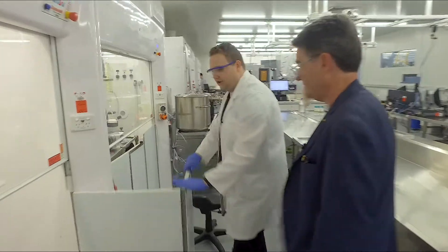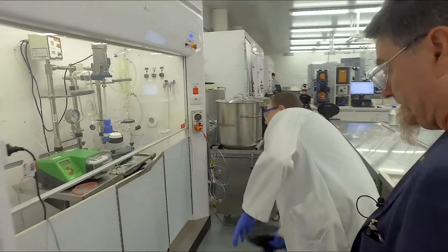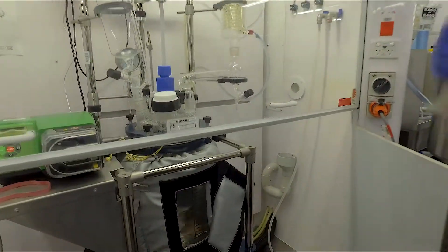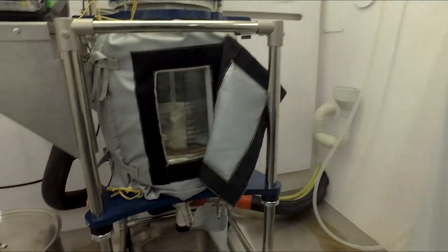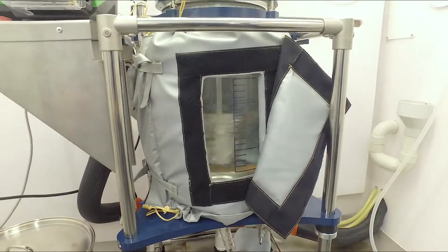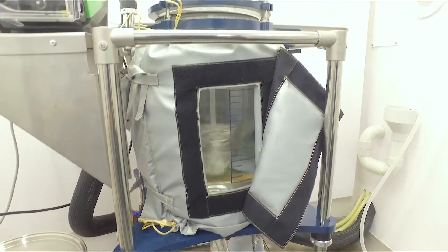And over here we go up a little bit further. This is our 20-liter reactor, and it is capable of producing kilogram batches. Kilogram batches, in my opinion, is the big leap into an industrial process.